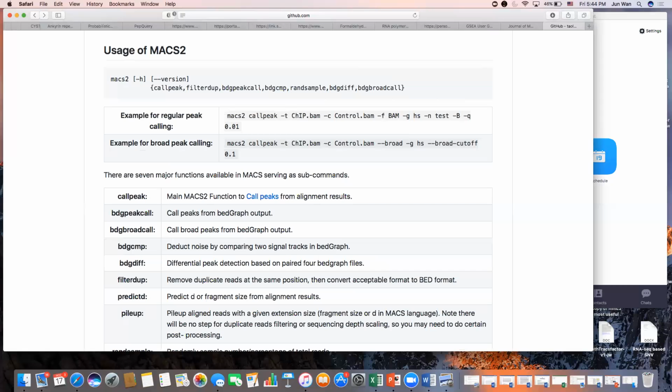So we'll get through this part. This is going to be the part that isn't fun. The rest of it will be a lot of fun, I promise you, because this is a great little pipeline. It's fantastic. Bowtie 2 is wonderful. SAMtools is straightforward to convert a SAM to BAM. And MACS is a really efficient program for calling peaks, okay? Any questions about any of this? And I really mean this. Please come to my office, email me, call me. I'm more than happy to help you get through this because this is a very, very important module. You're going to see a lot more of this happening, okay?